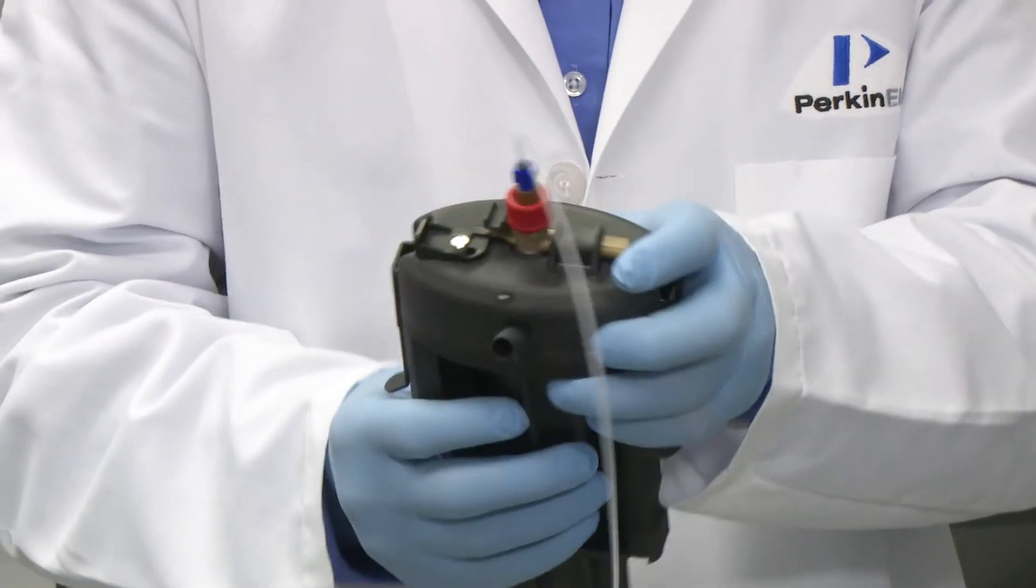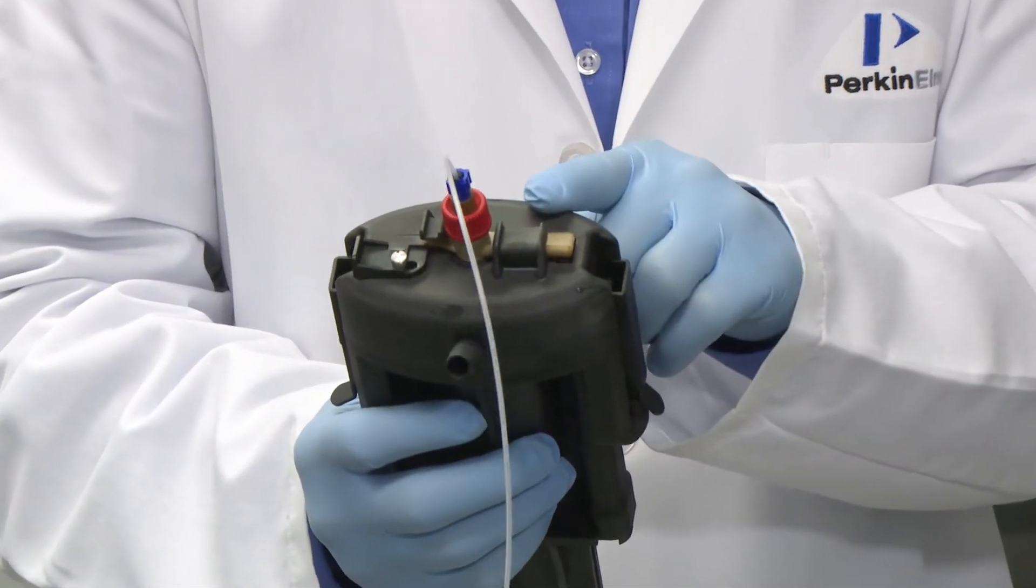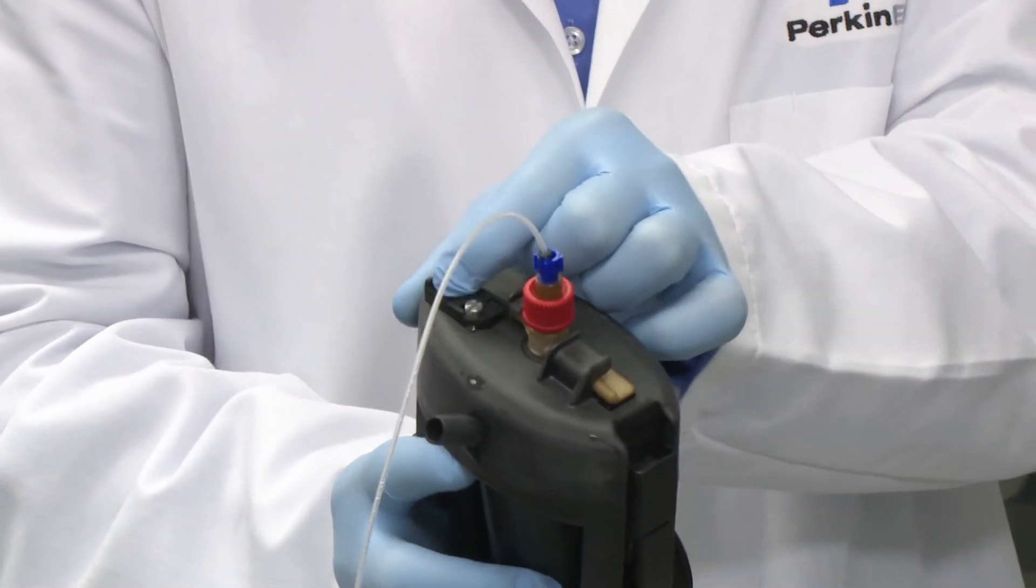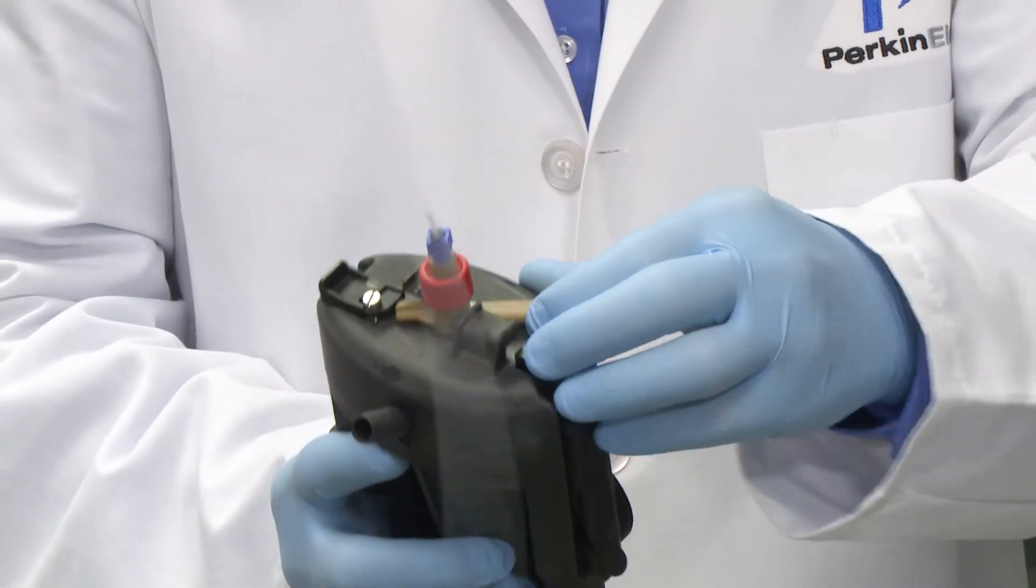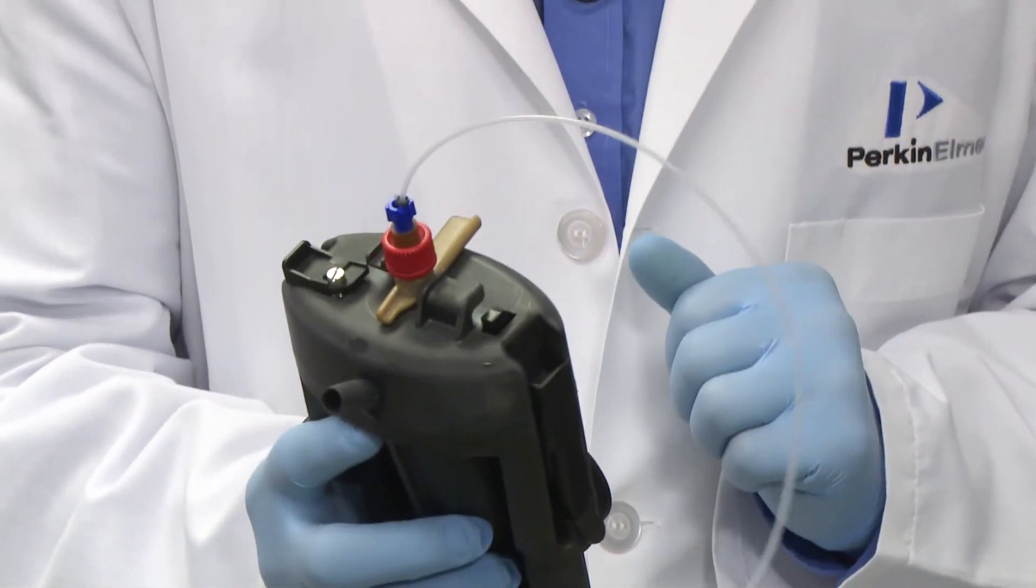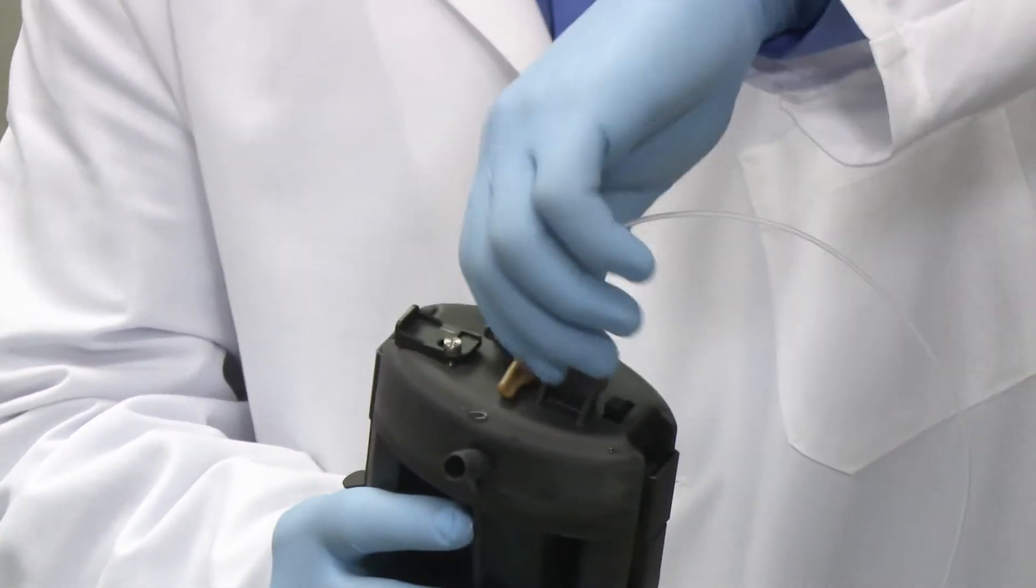Next, you are going to remove the nebulizer from the end cap. Do so by unlocking the nebulizer and rotating the arm 90 degrees to the unlocked position and pull the nebulizer out.